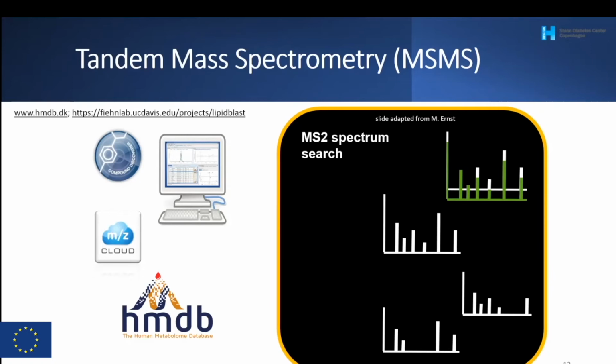These libraries can be public, or they can be something that you build by measuring all sorts of known molecules. We see if it matches this one, or this one, or this one, and then it's a perfect fit with a certain percentage, so it must be this molecule.